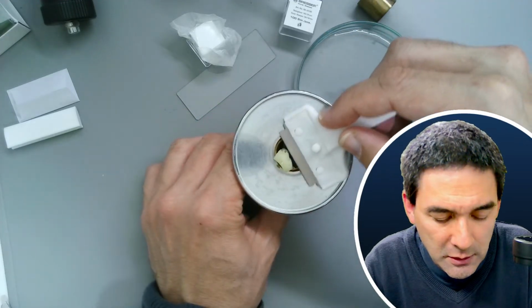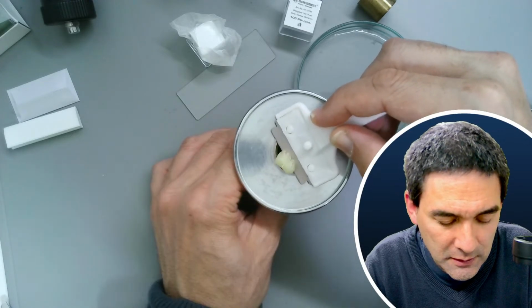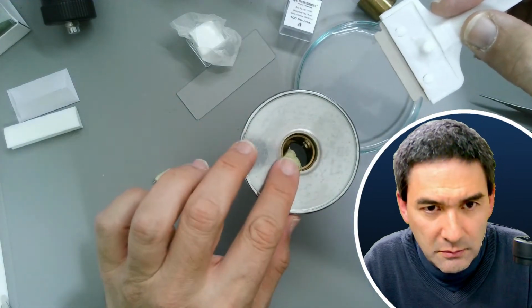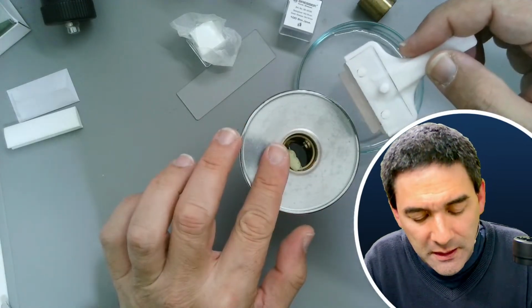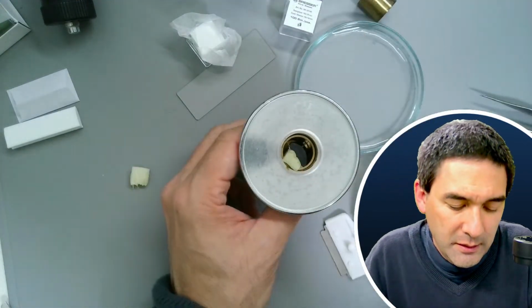Let's go. I have to also move it a little bit. See, it's a little bit too thick, but that's the first cut. Sometimes, because of the flexibility of the blade, it's not completely flush with the surface. So that's a little bit of the problem here as well.